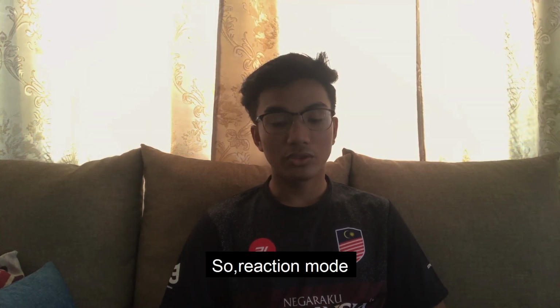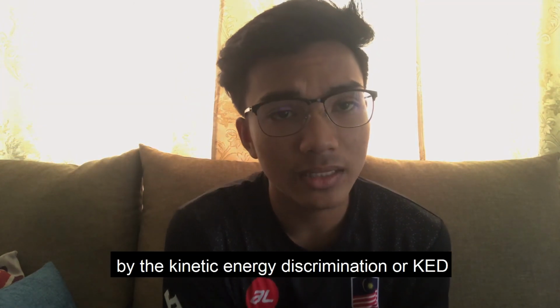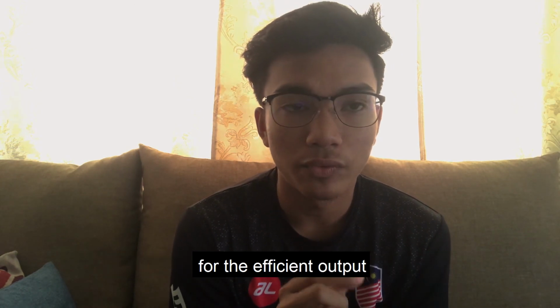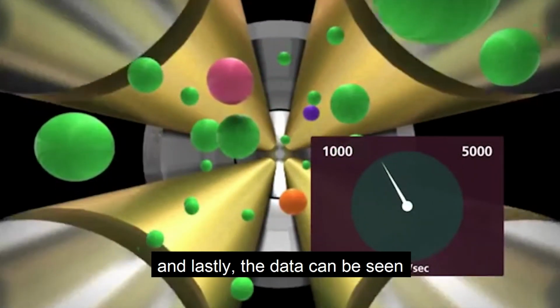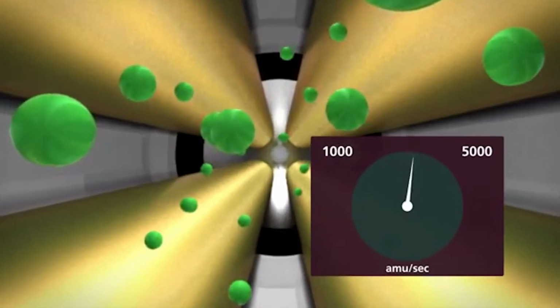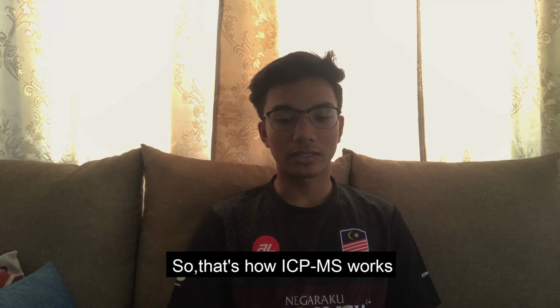Reaction mode uses a highly reactive gas targeting interfering ions and removing them, and it is also aided by kinetic energy discrimination, or KED, for efficient output. When the ions arrive at the detector with nine orders of dynamic range, they are detected. And lastly, the data can be seen in the software on your computer. So that's how ICP-MS works.